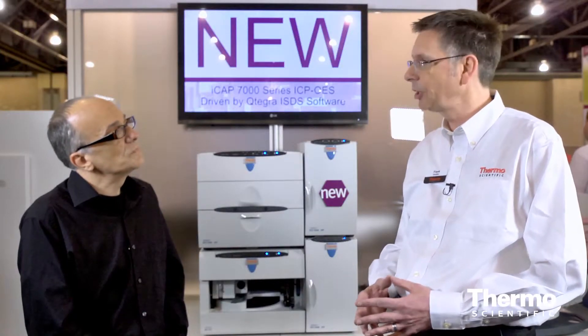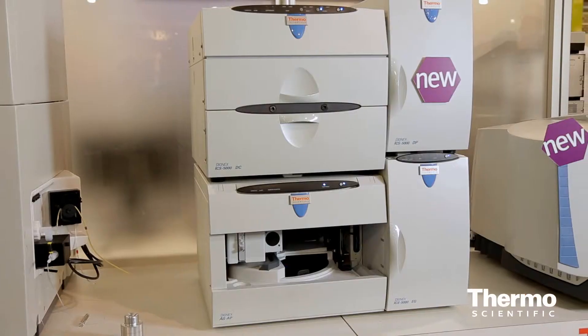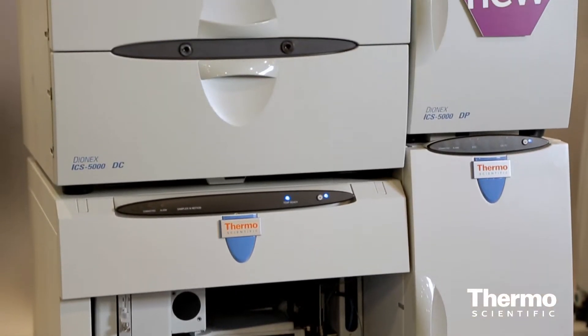That means we are now supporting high pressure ion chromatography and all existing chemistry on the ICS-5000 Plus, and that includes capillary ion chromatography format, micro-bore as well as standard-bore chemistries.